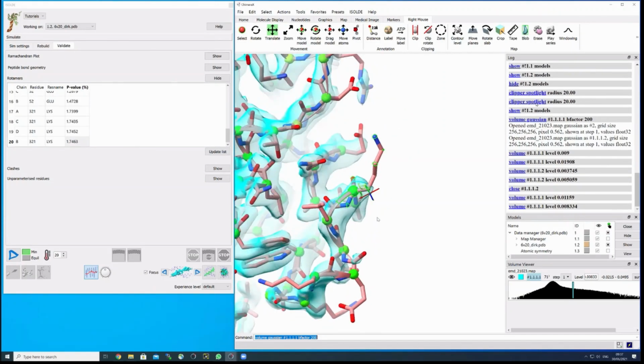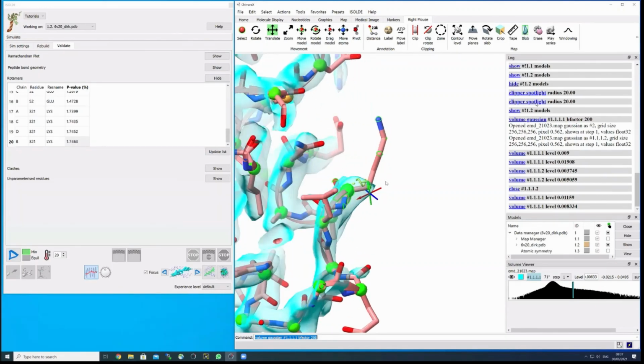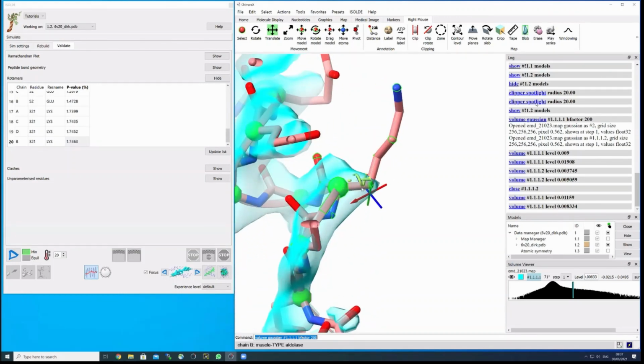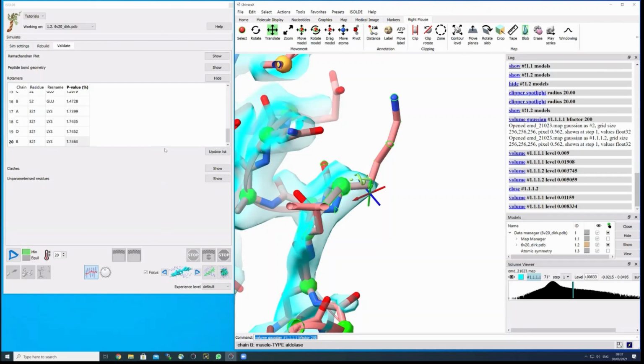And that's typically the case in proteins because you need some charged residues on the outside to make it soluble. But because it can move a lot and has a lot of different sidechain conformations that are possible, we hardly see the sidechain itself. Again, it doesn't make sense then to model it as an outlier because it's not covered by density. Whether one wants to be so pedantic to change it, okay, maybe that's more than something I would do, but this is just one example.